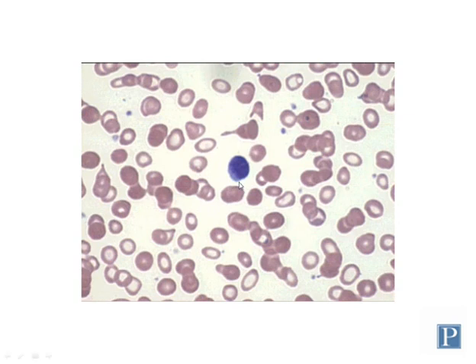To actually see the platelets, they're released into the bloodstream. So you should be able to see platelets all throughout your blood smears. And platelets are not cells themselves, rather they are disc-shaped fragments of cells that bud off of the surface of megakaryocytes. So they don't have nuclei, they have a little bit of cytoplasm, and they just look like these little cellular fragments. You might think that they are just debris or dirt on the slide, but these are actually platelets, and you should be able to find them all over the place.